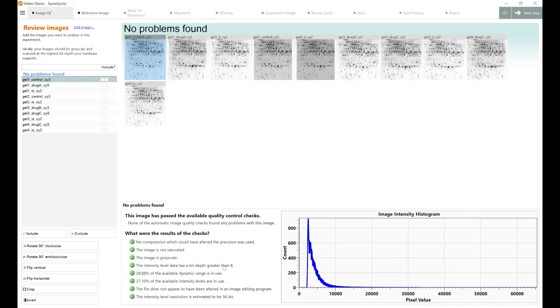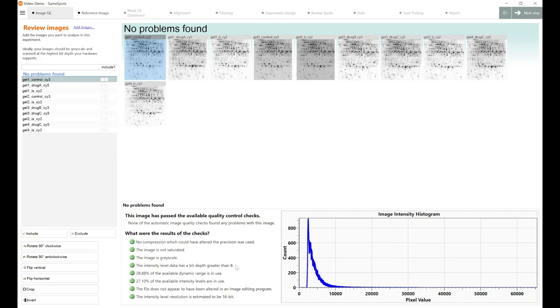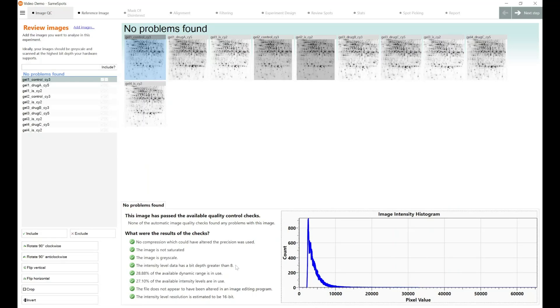The intensity level data has a bit depth greater than 8. The importance of the bit depth of your image for analysis and for accurate measurement is the intensity level. An 8-bit image can have a pixel value for each individual pixel of a range between zero, which would be white, pure white, and no data, or 255, which would be as black as it could possibly be.